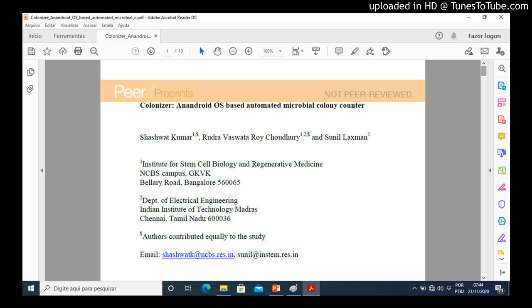E. coli colony growth. Bacterial colonies grown on LB agar in standard 9 cm petri dishes were used as sample images. Bacterial colonies of slightly varying densities in the range of 50-400 were grown on agar plates using standard microbiological procedure and grown at 37 degrees Celsius.